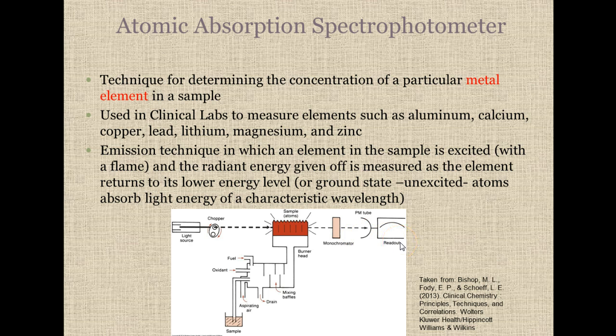What you're going to be familiar with memorizing for this is the fact that it tests for all these metals, and then the emission technique, as you see here, which you're going to have to memorize that definition as well.